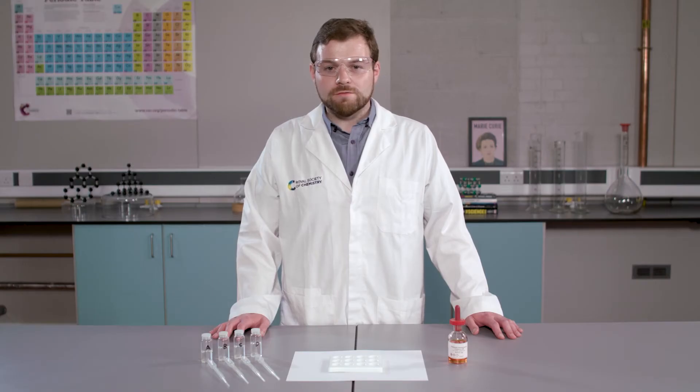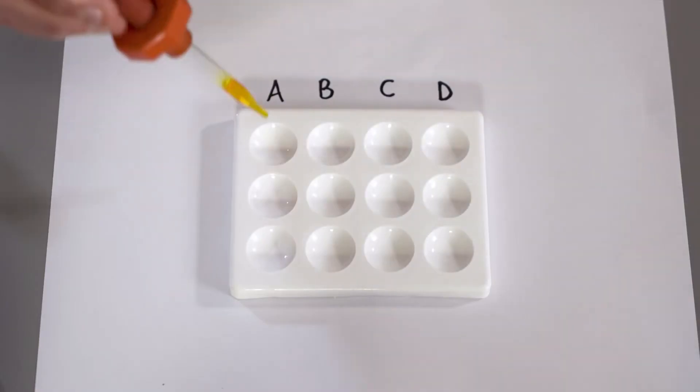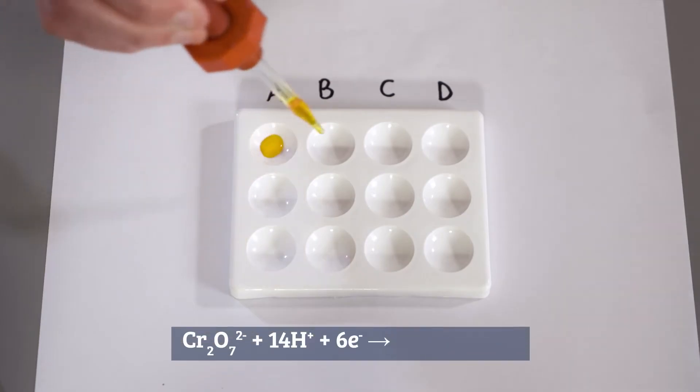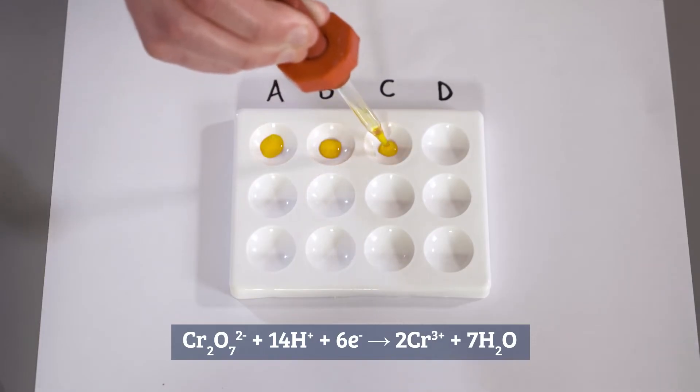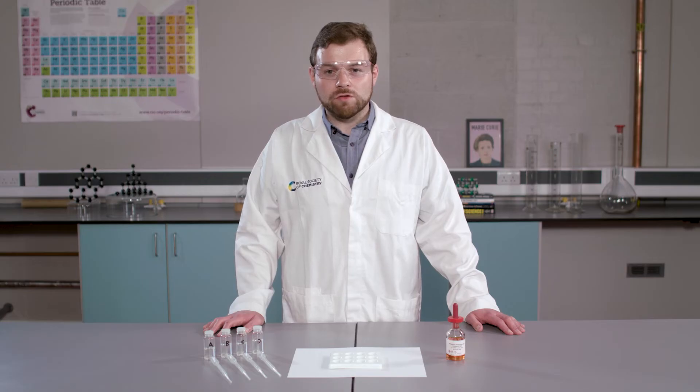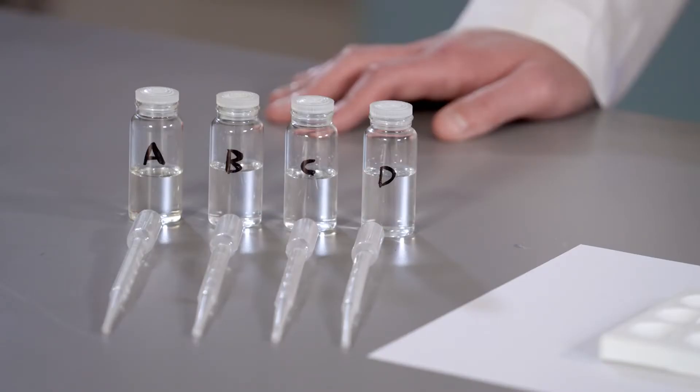For this test, I am going to add a few drops of acidified potassium dichromate to 4 wells in a spotting tile. Potassium dichromate is an oxidising agent. Here we are expected to see a colour change from orange to green, as the chromium 6 ions are reduced to chromium 3 ions. This was in fact the basis for old-fashioned breathalysers. A positive result here indicates the presence of either a primary alcohol, secondary alcohol or aldehyde.